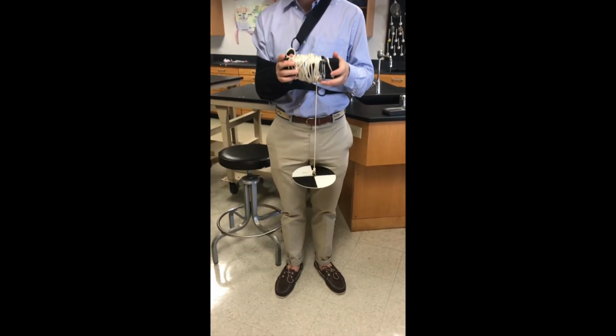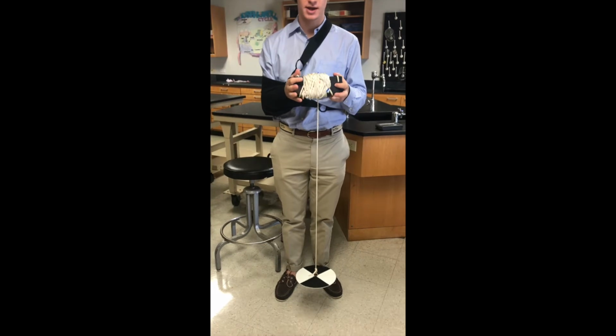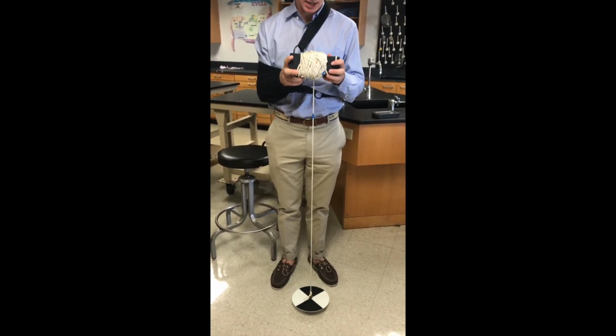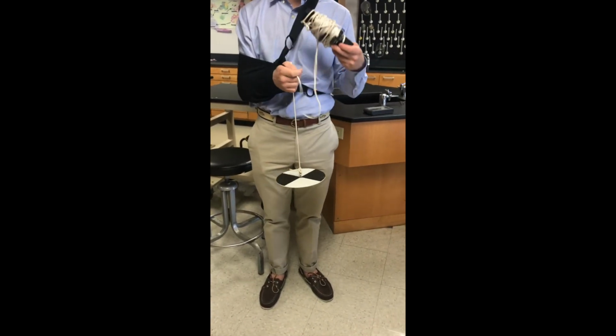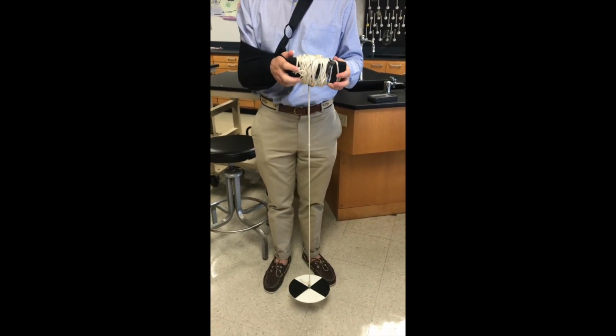This is a Secchi disc, and you lower it into the water, and you keep lowering it until you can't differentiate the black and white, like so. And that dictates the haziness or clearness of the water.